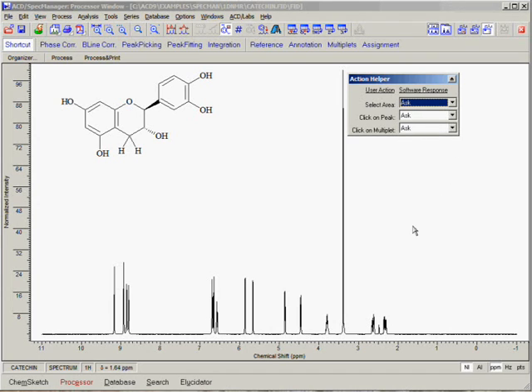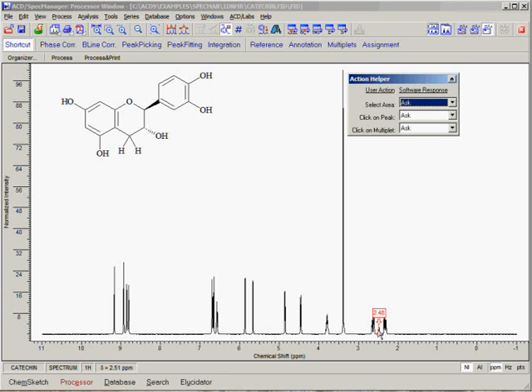Let's demonstrate. As a first step, we will likely want to reference the spectrum and identify any impurities or solvent peaks that are present. In this example, the reference peak is DMSO, which is appearing at about 2.45 ppm. In order to place it at the correct position of 2.5 ppm, we need to set the reference to this peak.